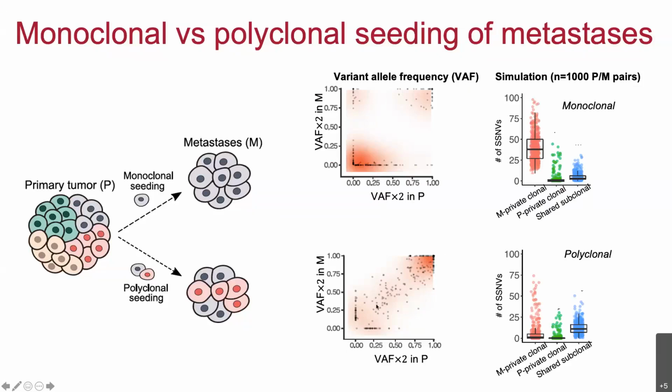So mutations found in the metastasis are also found in the primary, and this occurs really along the whole range of allele frequency values. And so you might argue that we're seeing an enrichment for what are called shared subclonal events. So many of these are down in this range. So with the simulation framework, we can then establish cut points, derive those empirically, and then ask, how does this look in the actual patient data?